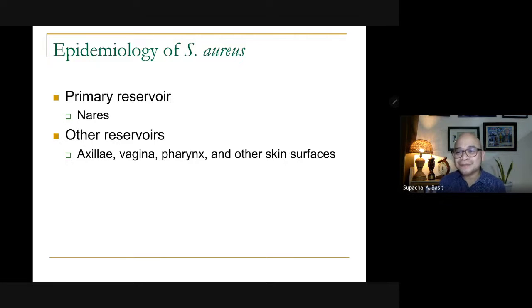When I was still teaching in the lab during the face-to-face classes, usually one of our experiments would be with a sterile cotton swab, and the contest is called Padamihan ng Libag. We even had a squid game before, even before squid game became popular. Each one of your classmates would receive a sterile cotton swab, and then they will swab different parts of the body. Sometimes the axillae, the skin, the feet.